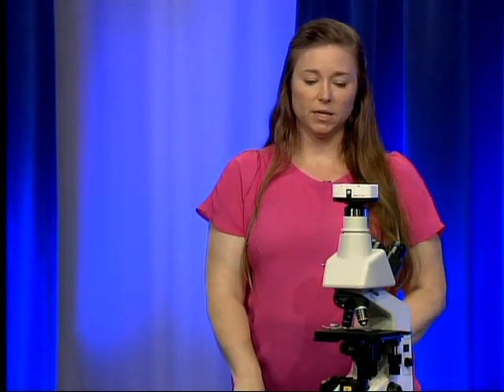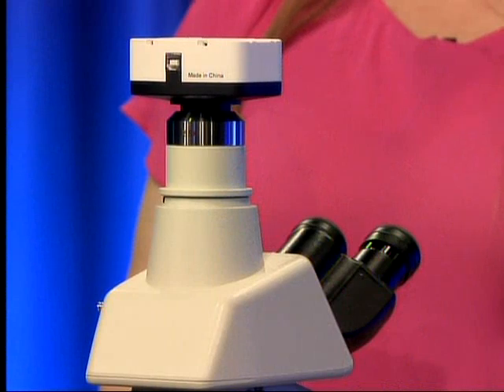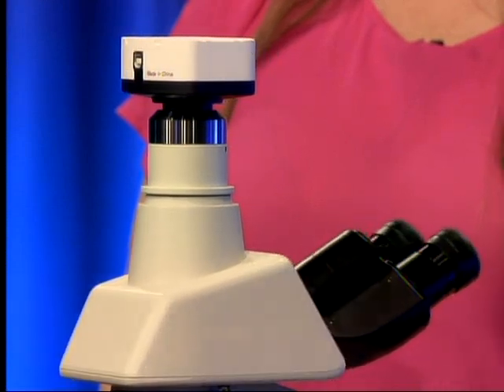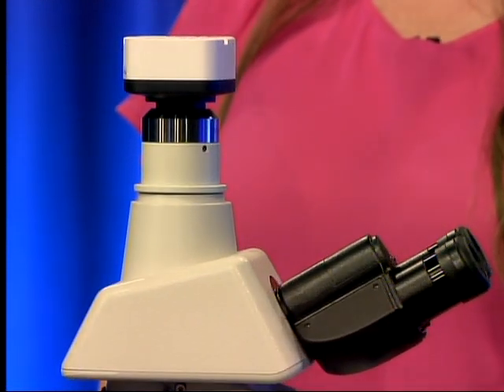There's not really any reason that you should take the camera off. Please do not. If for some reason you do feel like you need to take the camera off the top of the microscope, please contact a technical consultant and we will give you instructions and see if there's a way that we can help.